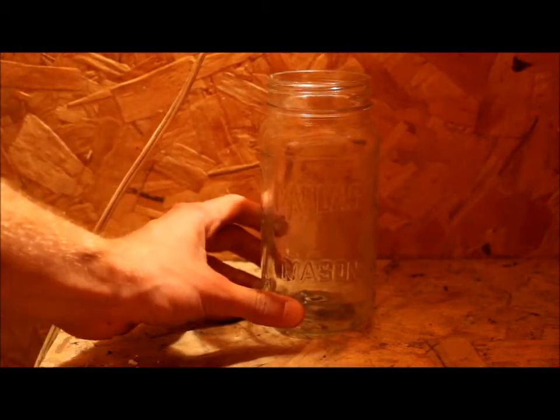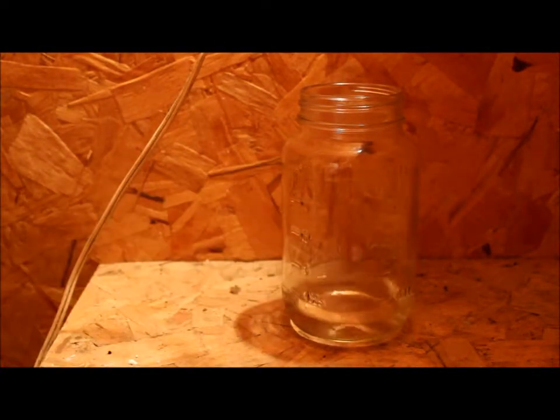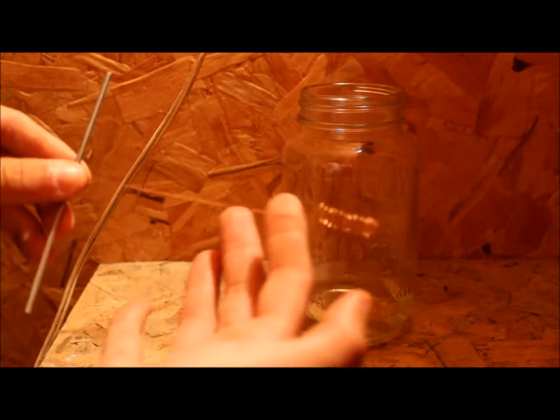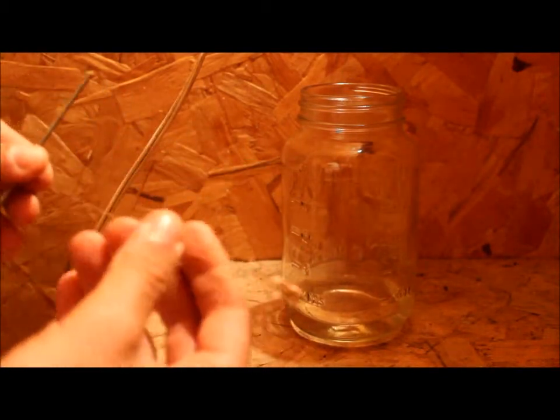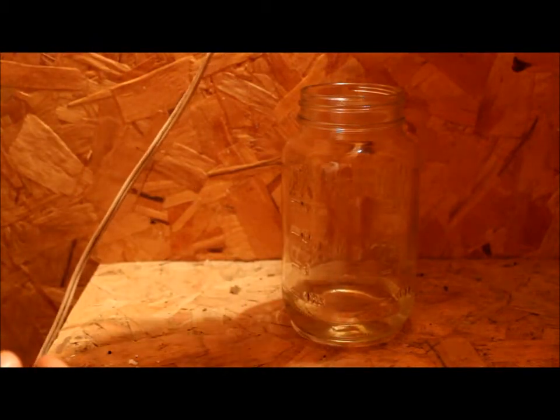Let's begin with a glass container. We're going to fill this container up with some acetone. After putting some acetone in the bottom of the container, I'm going to take a piece of copper attached to a piece of metal rod. I'm going to take this piece of copper, heat it up, and then place it into the container.